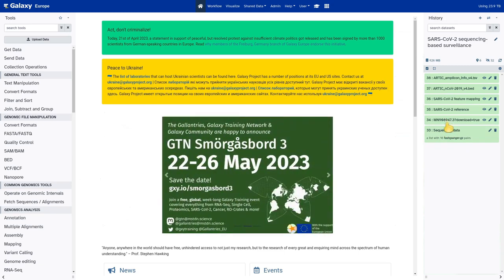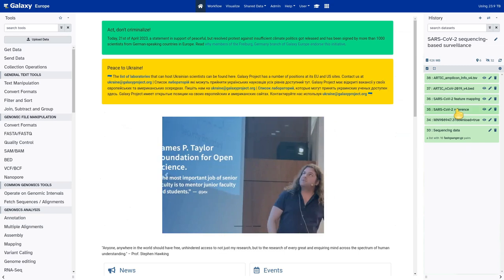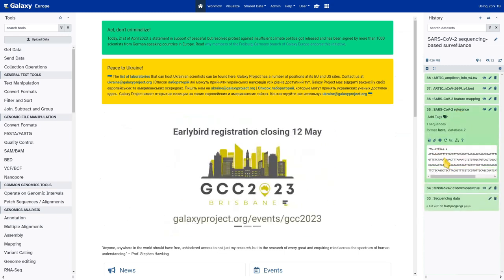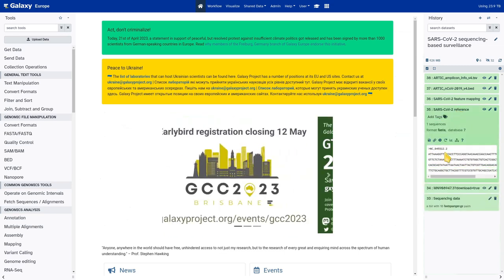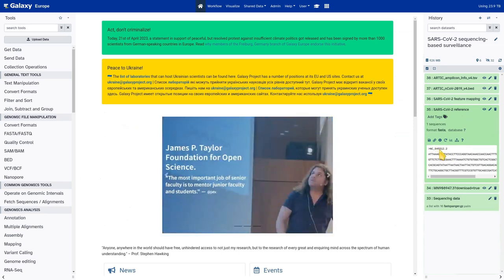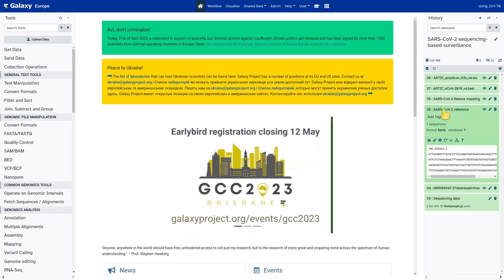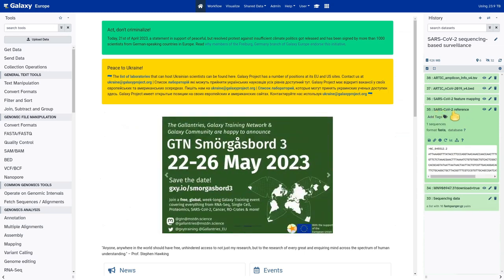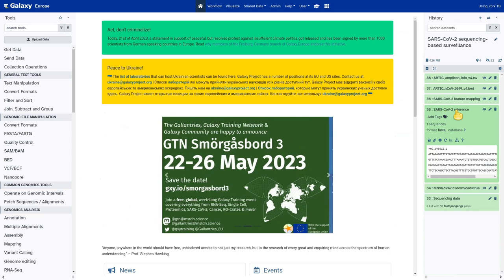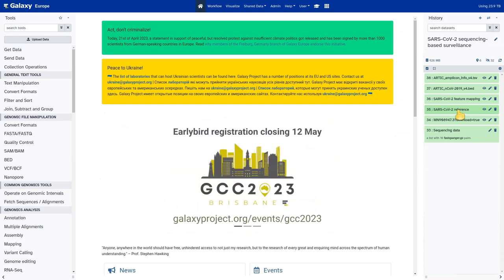Then I've downloaded the SARS-CoV-2 reference sequence just as described in the tutorial, and I ran the Replace Text tool on it to change the name of the sequence identifier to NC_045512.2. According to the instructions, I renamed this dataset to 'SARS-CoV-2 reference' because that would be the input to the workflows we're going to run next. The format here is FASTA.